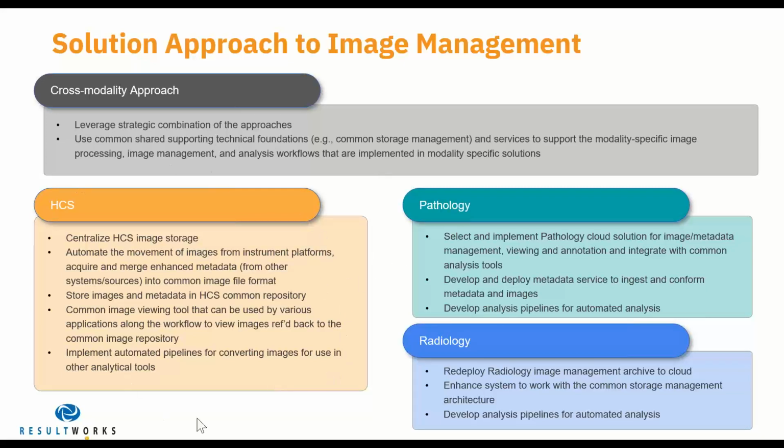With high content screening, we did get to the point of centralizing high content screening image storage. We did get to automate movement of images from acquisition platforms and adding enhanced metadata into a common image file format.